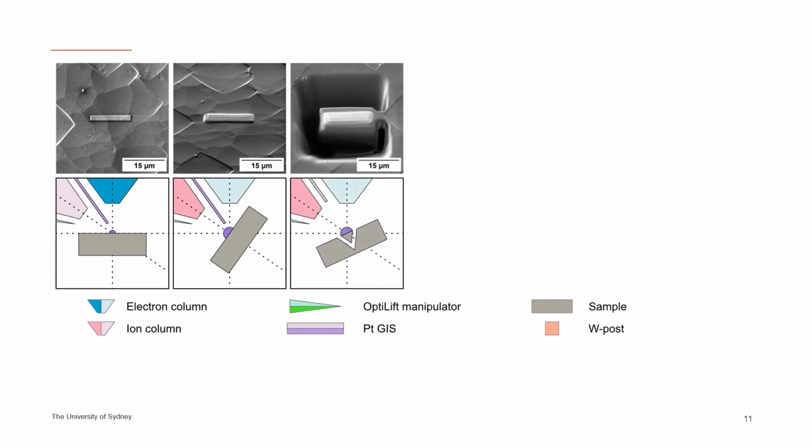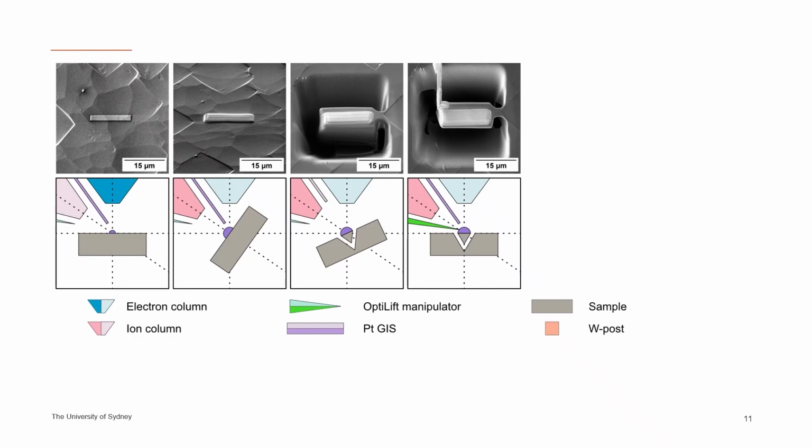As a next step, we would proceed by undercutting the sample surface with a 25-degree stage tilt to generate a wedge-shaped specimen, which is then picked up using the micromanipulator at a 0-degree stage tilt, as shown here. As long as the sample is reasonably flat, that is no problem.